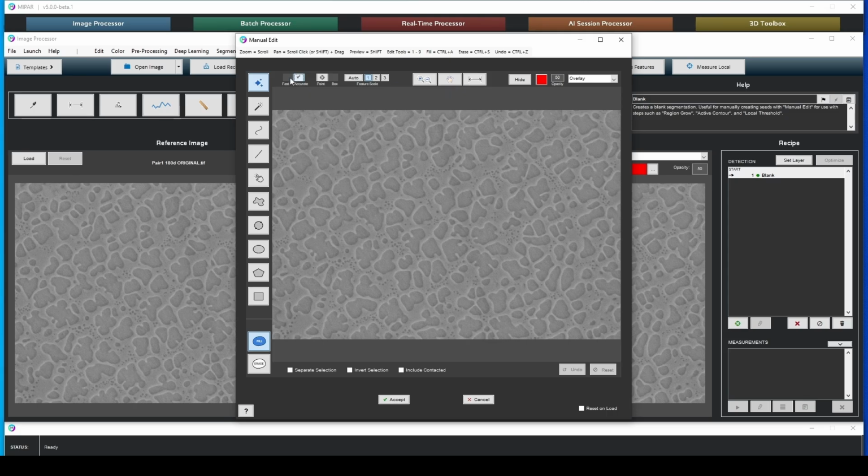So Snap works in a way similar to Spotlight, where Spotlight has a grid point, and on each grid point we run the algorithm to detect features. We can manually prompt it, and it will update as we move our cursor around the image. This is what it looks like.